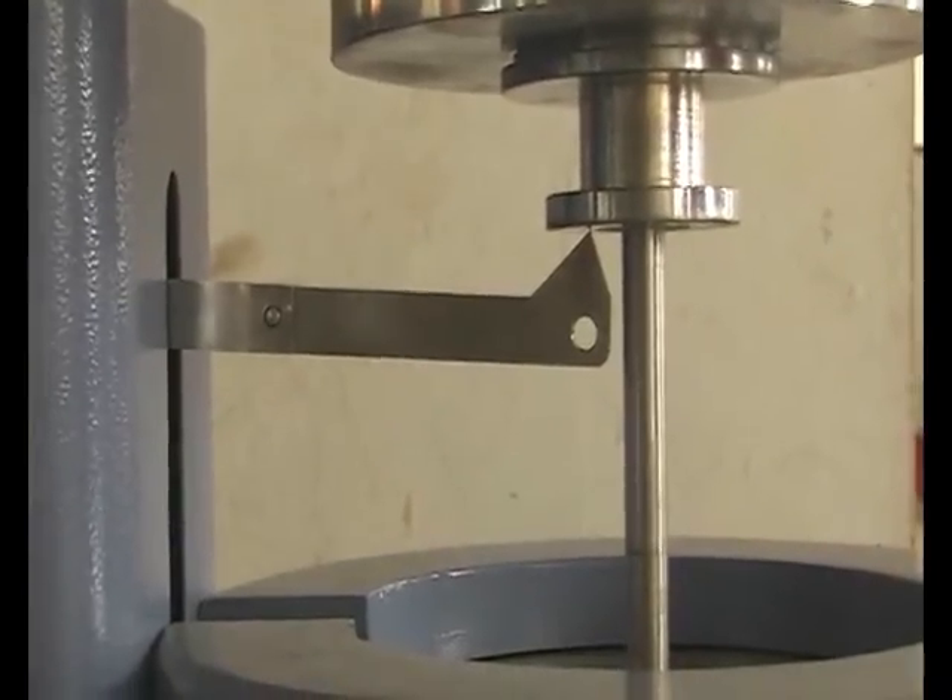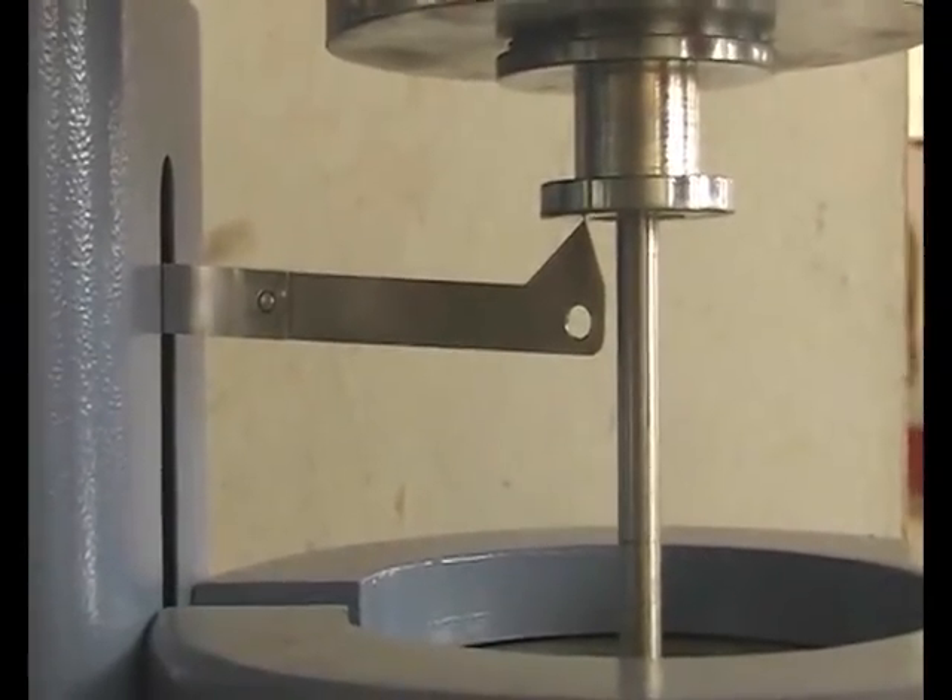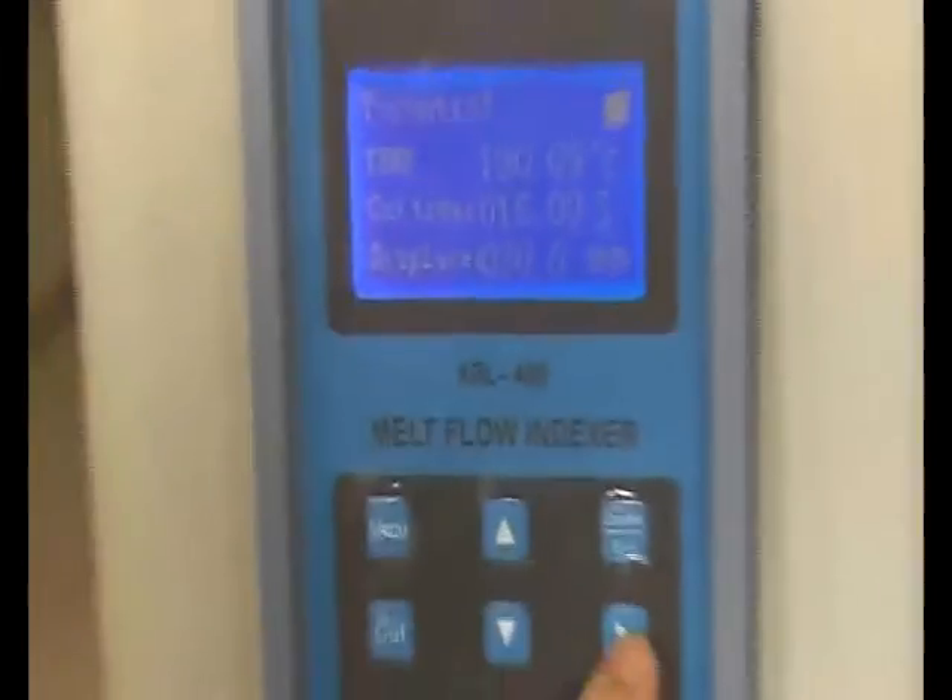There will be a stop signal on the screen when the test is finished. Now you can press the right key to proceed.